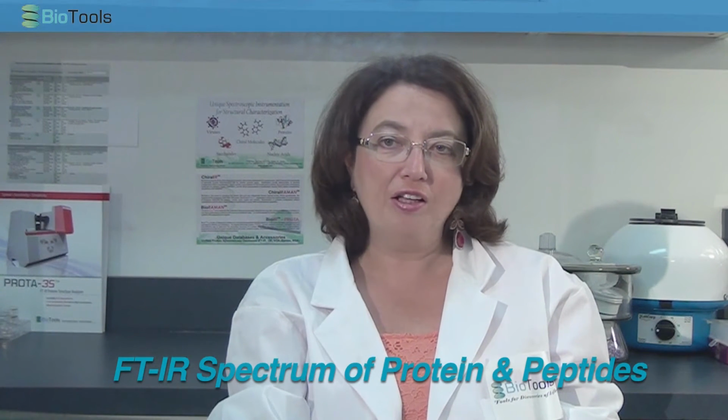The goal of this educational segment is to answer some of the questions I have encountered for the past 17 years while training hundreds of scientists on the use of FTIR spectroscopy for structure elucidation of proteins and peptides. FTIR is a well-established technique, but its use for conformational analysis of biologics has only recently been recommended and accepted by regulatory agencies worldwide. The use of FTIR for small molecules is straightforward, but biologics require more care and knowledge to properly measure, analyze, and interpret such spectra.